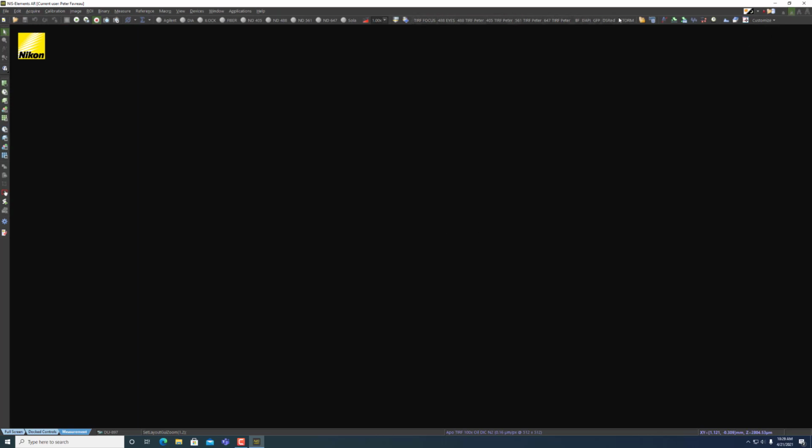Up here we have just optical configurations. I'll get into that in a second. And we have shutters here. There's a ton of different shutters on this corresponding to the light source that you want to turn off and on. So the ones we'll be talking about today especially are the SOLA. The SOLA is our LED light source, and that provides all of the fluorescence light that we're going to use for taking a look at images today. I'm not going to show it today, but the DIA is the same one if you're familiar with the confocal videos. It's diascopic illumination. And that's just our bright field lamp. So these are both the shutters for those. In order to see either one of these light sources, these both have to be turned on.